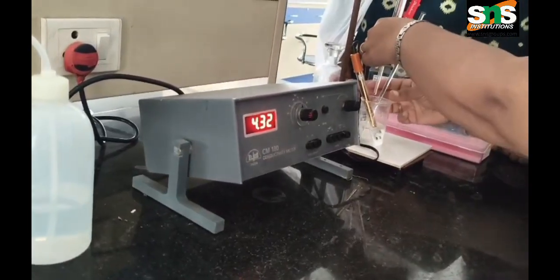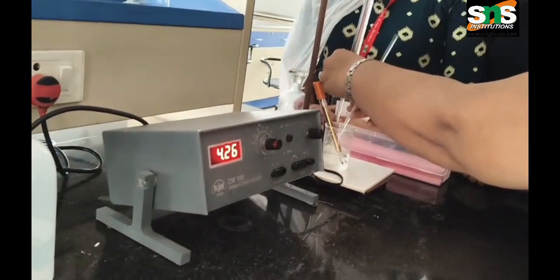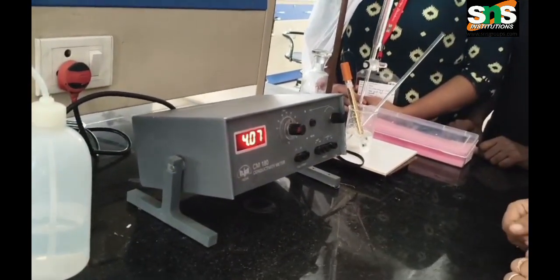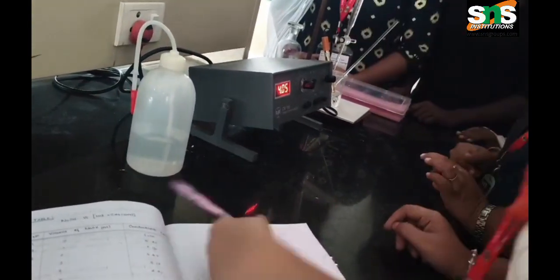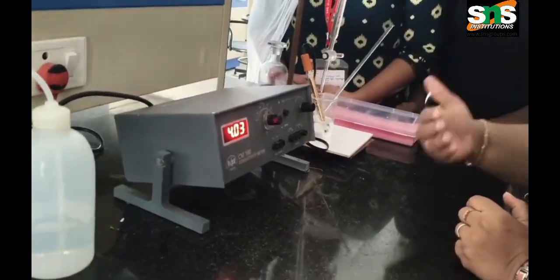Now I am adding sodium hydroxide and stirring the solution. The conductance value is again decreasing. Note the value. So you are having a decreasing value, and you have to take the readings.